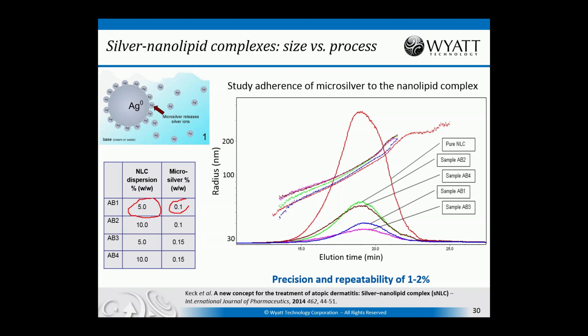So this is radius using multi-angle light scattering. There's, of course, a very large distribution, a large heterogeneity within any given processing condition, but between the 2 conditions, there's a significant difference. The precision and repeatability of these measurements are just a couple percent in size, and so the differences that we see here, which are on the order of 10% or more, are quite noticeable.